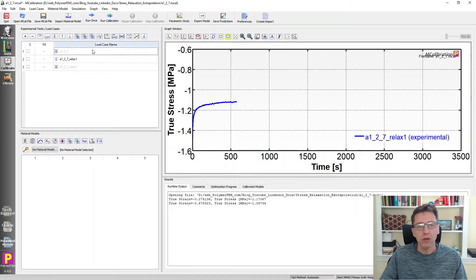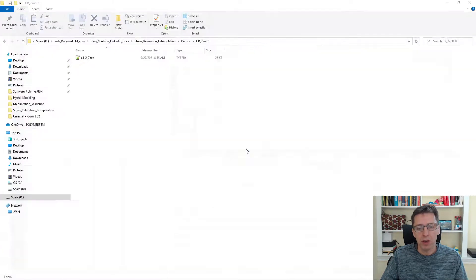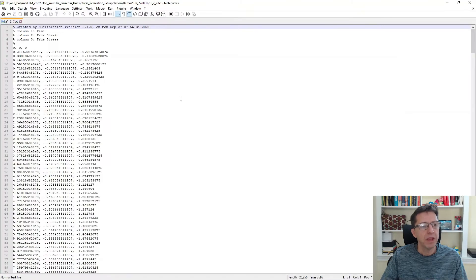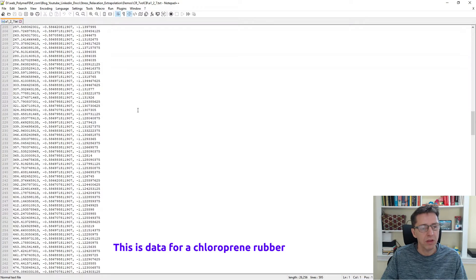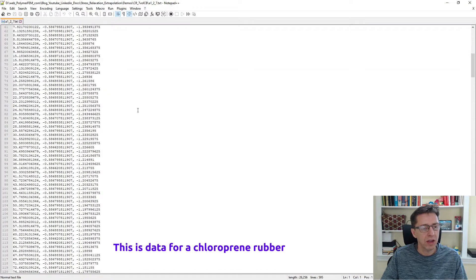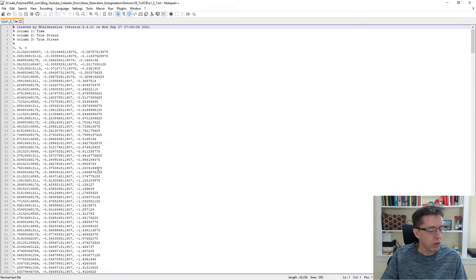The first thing I'll do is open up a file that I have to demonstrate these concepts through. I have a file here — I'm going to double click on it. It has time, true strain, and true stress. It's a single test that I'm going to demonstrate and work with. So how do we look at this data?